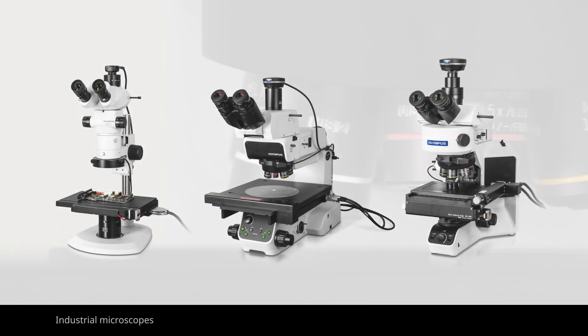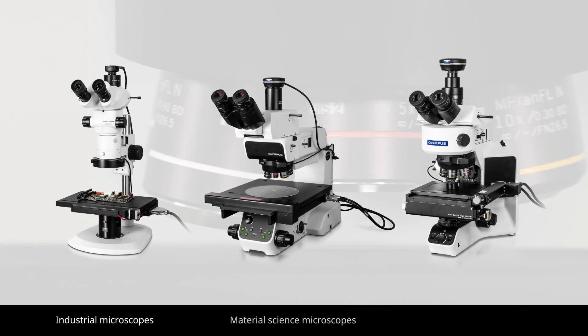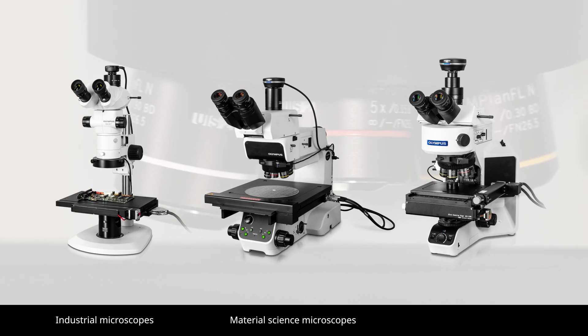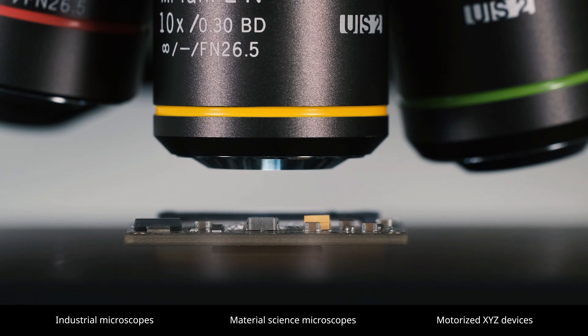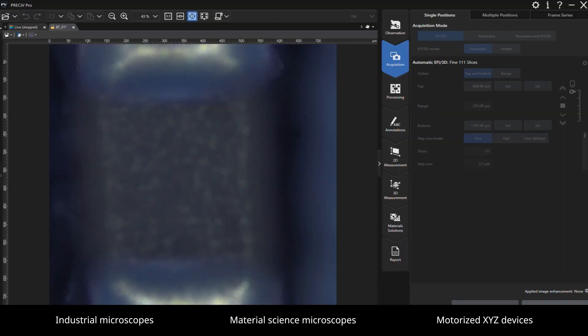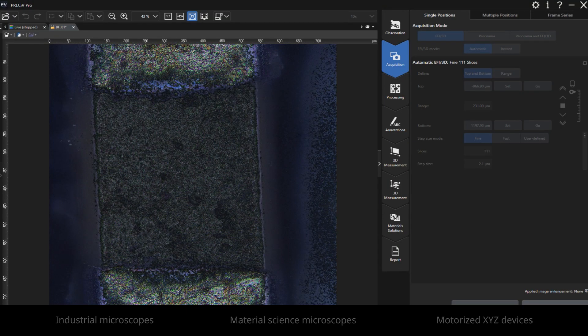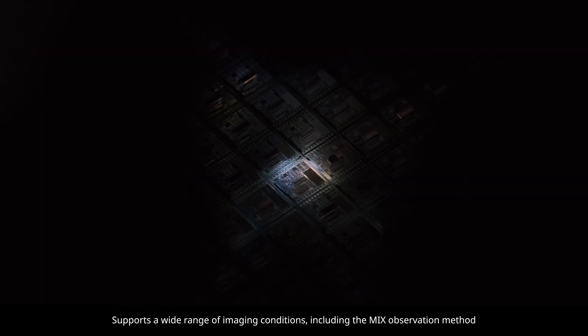The software enables you to control industrial and material science manual and semi-automated microscopes, as well as motorized XYZ devices for automated processes. It also supports a wide range of imaging conditions.